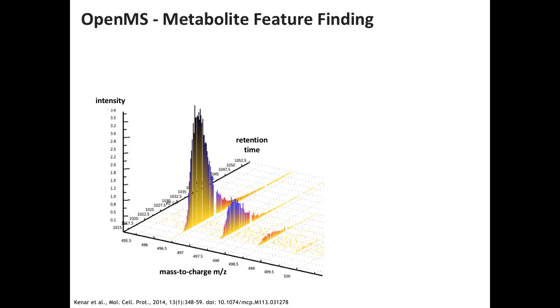You remember in proteomics, since we started out with low-resolution data, we tried to match this overall shape independent of resolution. In metabolomics, we started with high-resolution data straight away. That is why the algorithm has different characteristics and a different way of going forward with it.